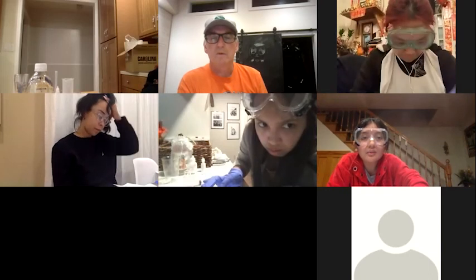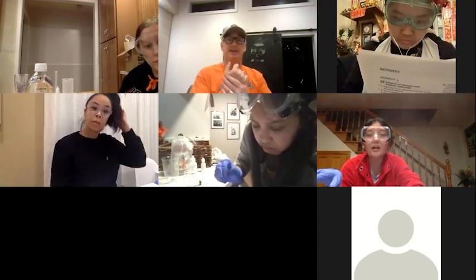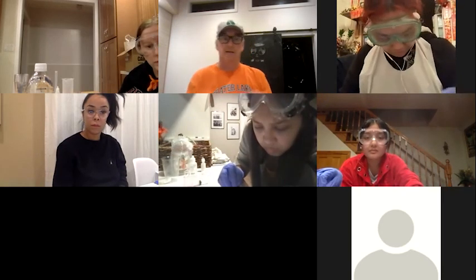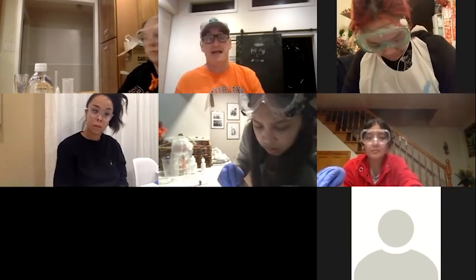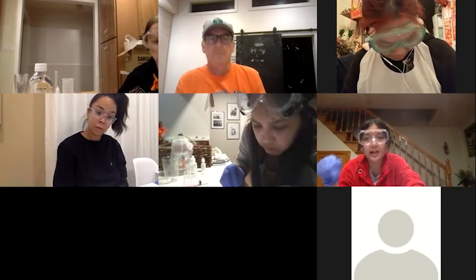Professor, I have a question. Sure, what's up, Rachel? For data table number 1, what do we put for the vinegar sample 2? Like the same vinegar? Exact same. Yep, exactly the same. So you rinse out your flask and you do it again. You measure another close to 5 mils and you just do the exact same thing. So we're doing triplicate replicas. And then for data table 2, that's when we use a different kind of vinegar, right?